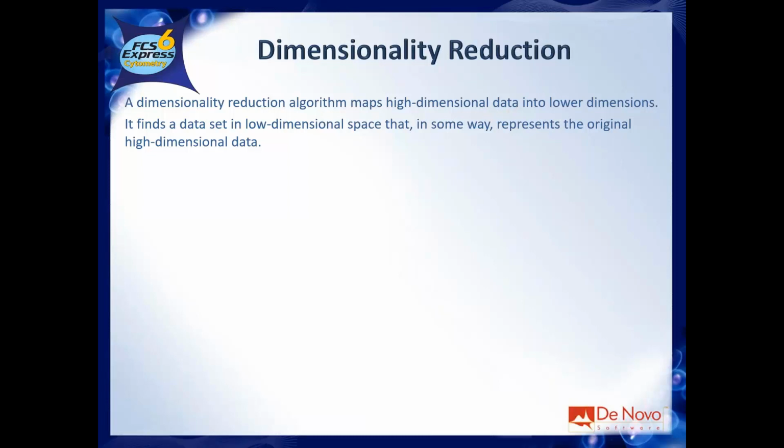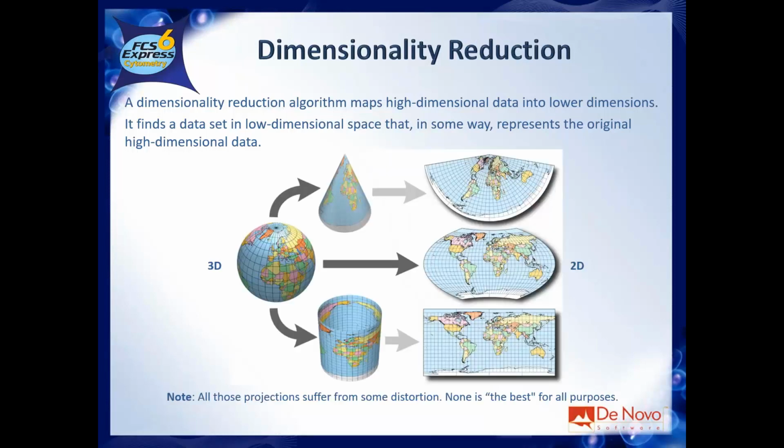When I think about dimensionality reduction, I always bring this example. To my knowledge, this is the first real example of dimensionality reduction. You see, we needed to move from 3 to 2 dimensions. And what you want to do with flow data or with mass cytometry data or whatever, is to go from 10, 20, or 100 to 2 or 3.